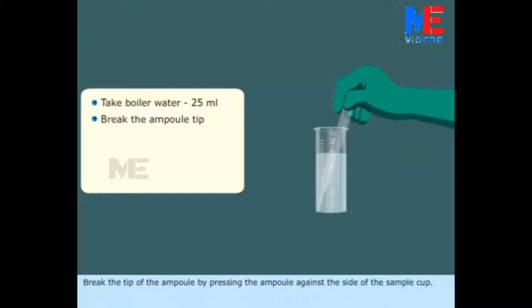Break the tip of the ampoule by pressing the ampoule against the side of the sample cup. The sample will rise to fill the ampoule and mixes with the reagent, leaving a small bubble.